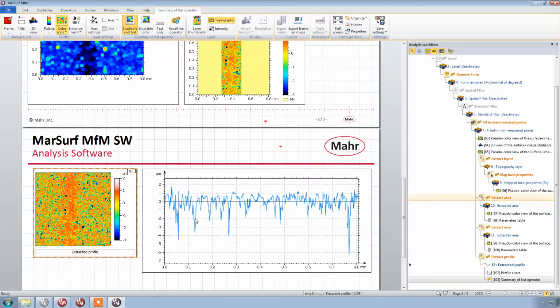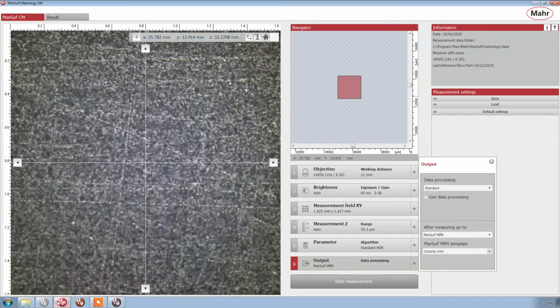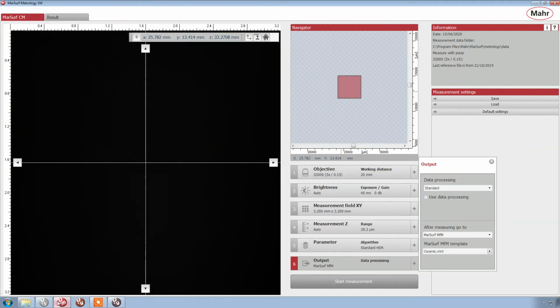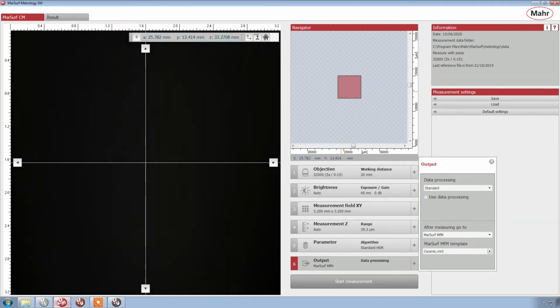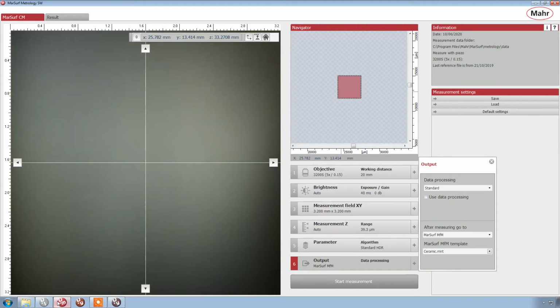From start to finish, the actual measurement, again, takes a couple of seconds, and I've been editorializing for what feels like 5 minutes. So we're going to go over to the acquisition software again. I'm going to move back to my 5x lens just so I have a little bit of room and so I can see what I'm doing. I'm going to take the ceramic coupon off and put my next part on. My next part is going to be the injection molded part.